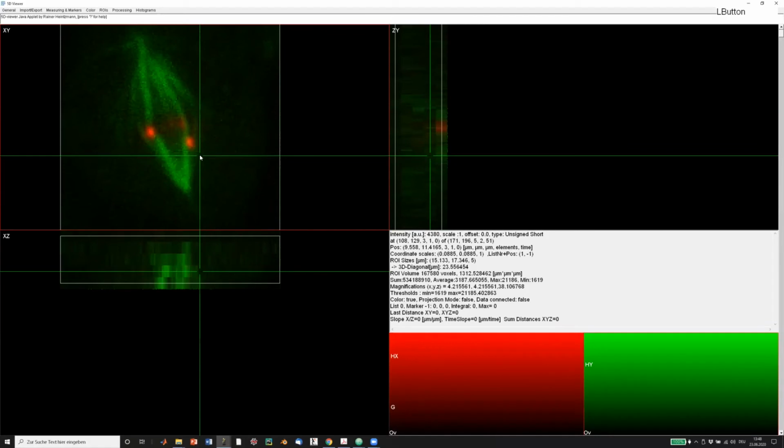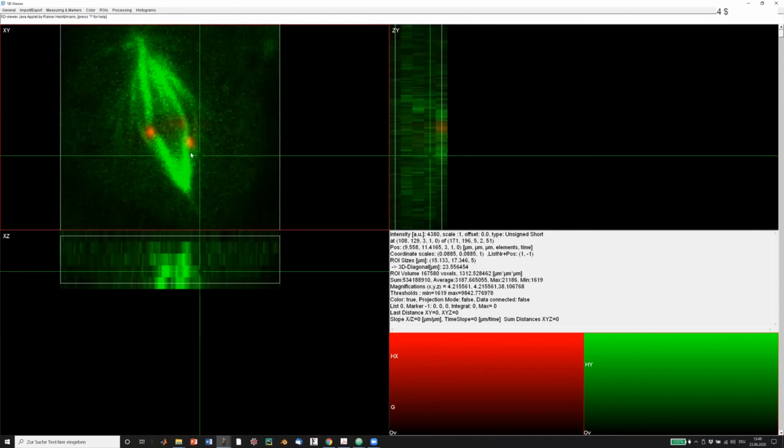So what you can do is change the lower and upper thresholds. Sometimes these things are also called contrast and brightness, but I prefer to work with lower and upper thresholds. So this viewer has lower and upper threshold values that can be set by the keys 1, 2, 3, 4, 5, 6, 7, 8. 1, 2 is the lower threshold, 3, 4 is the upper threshold. So if I press 4 now, I'm going to lower the upper threshold, which makes the red color, no, we are in the green color channel now, sorry. So the green color channel becomes brighter and brighter.